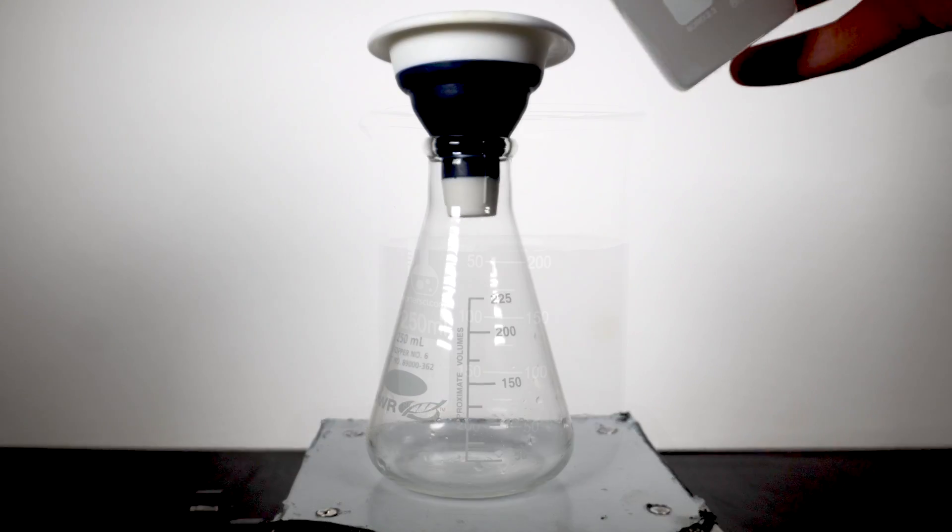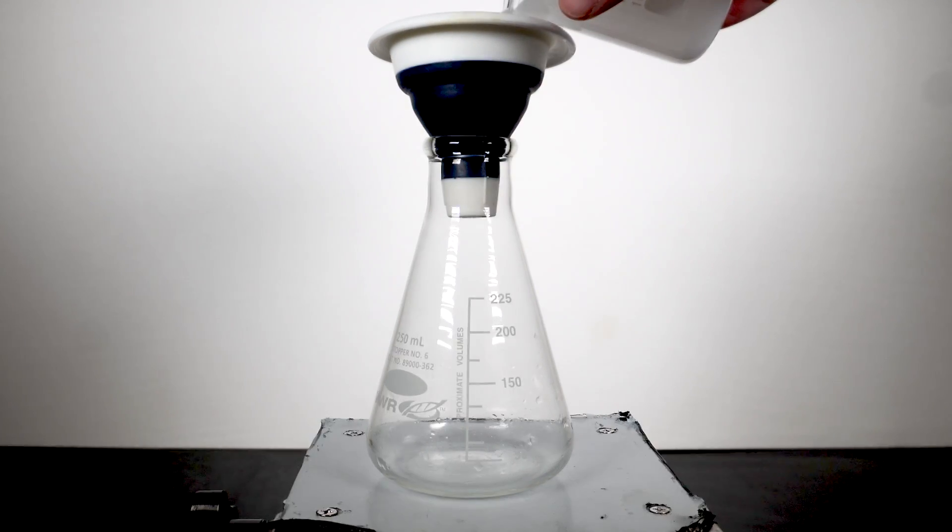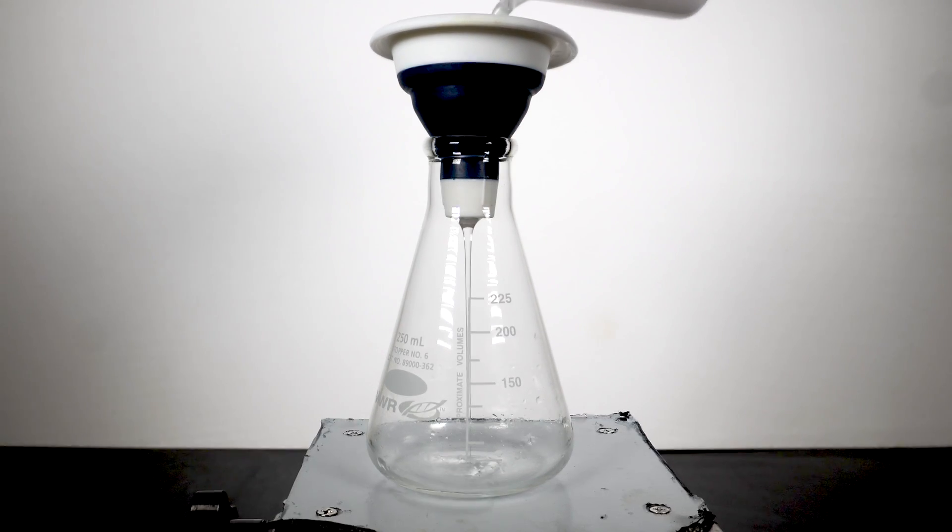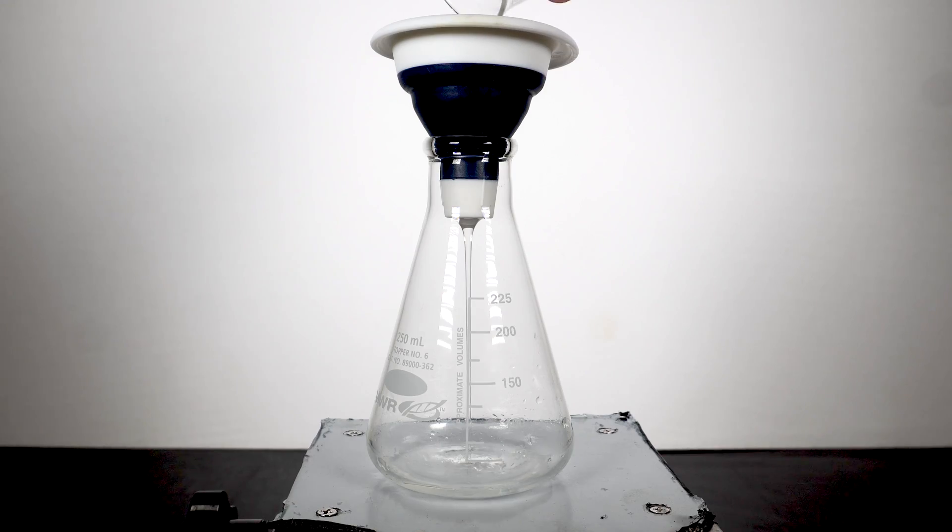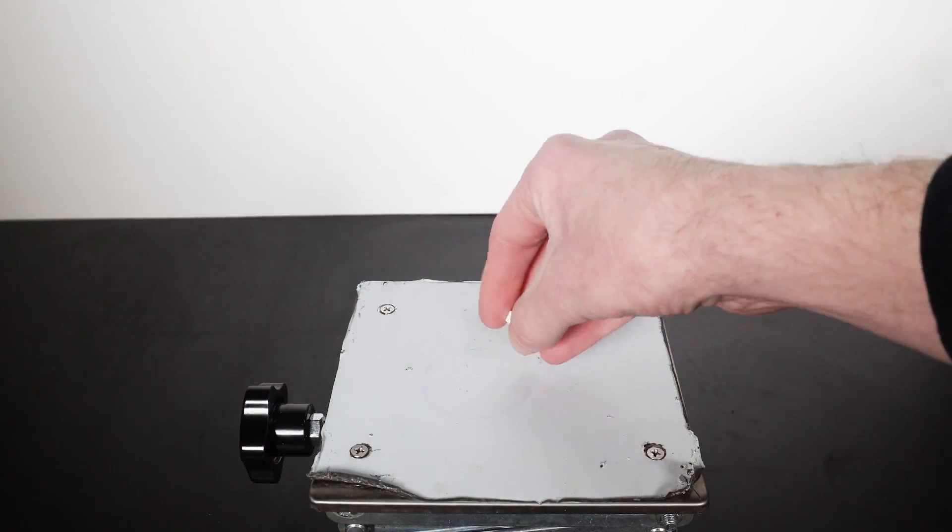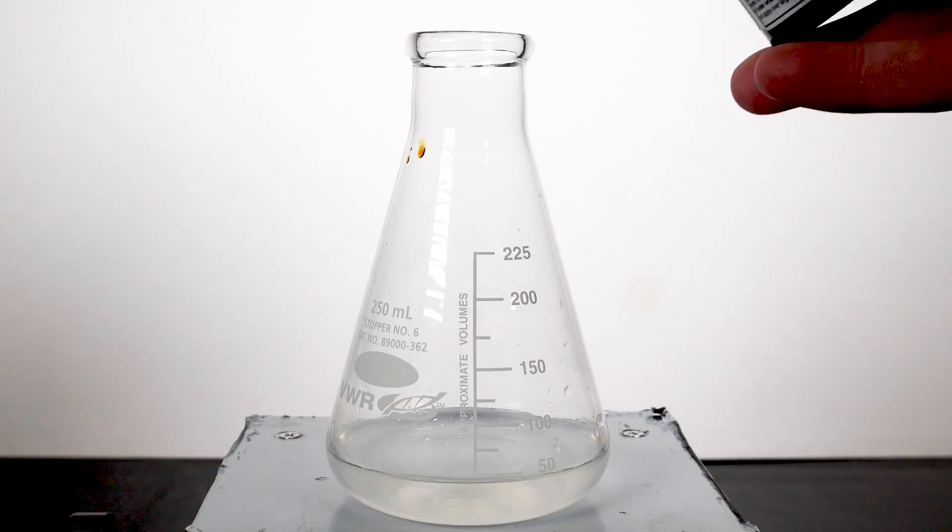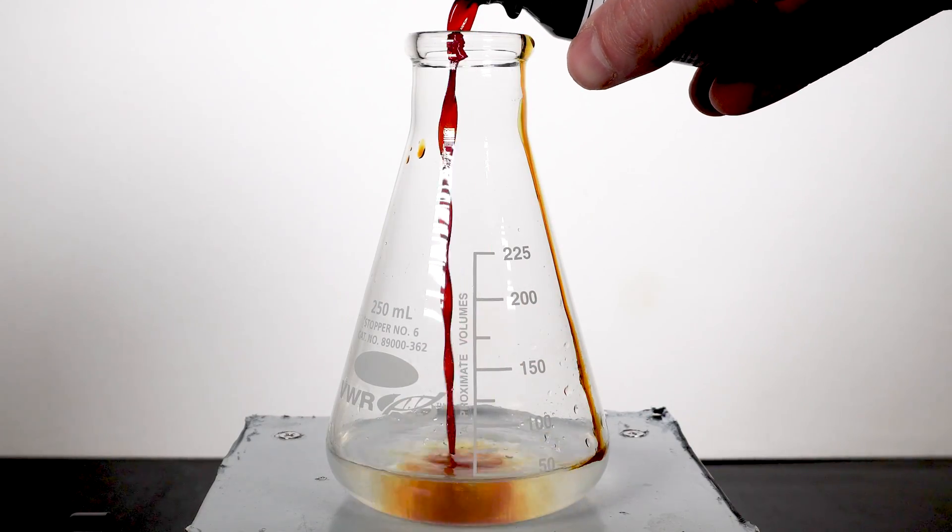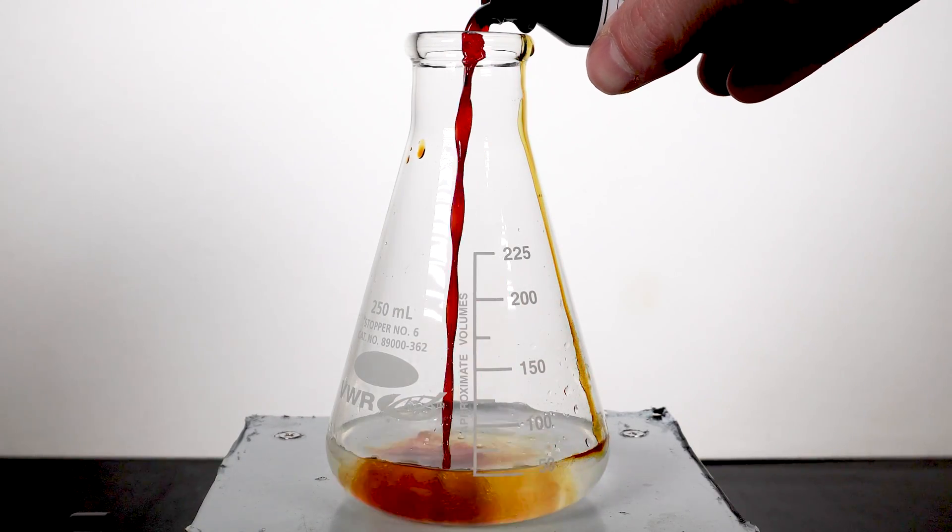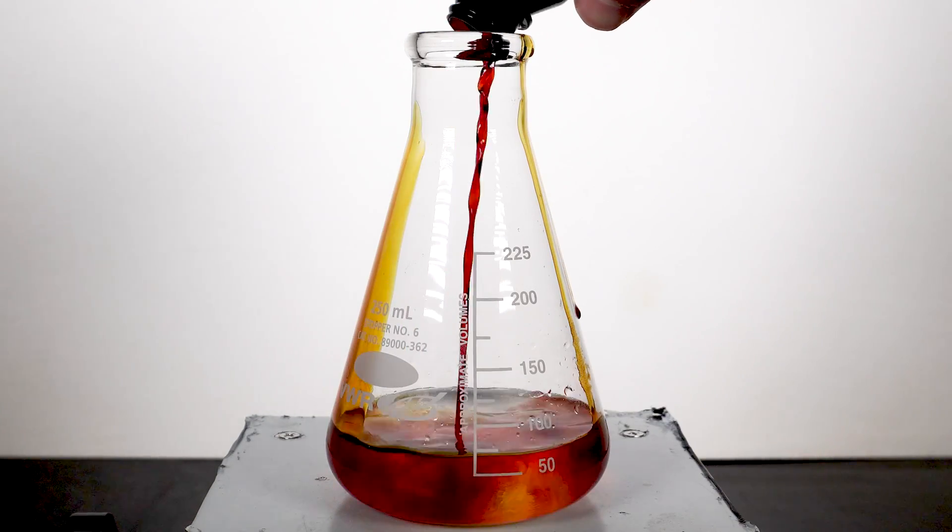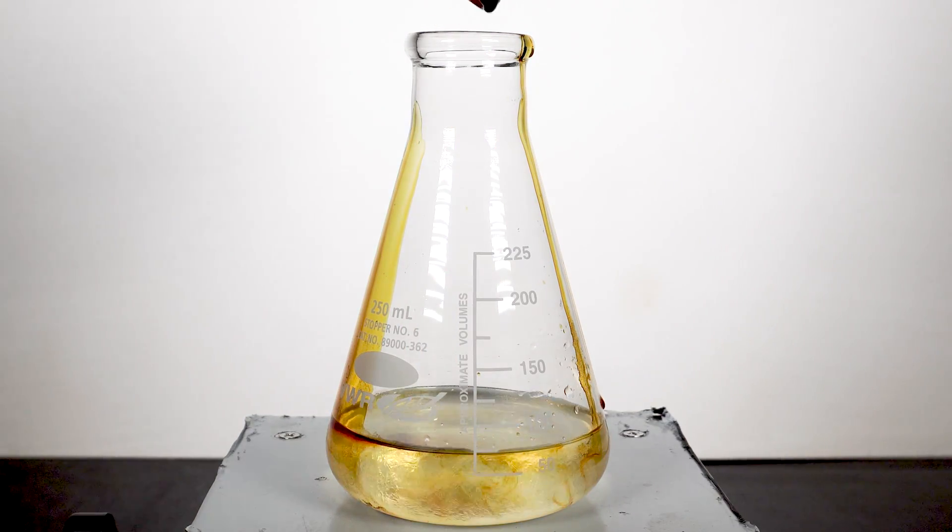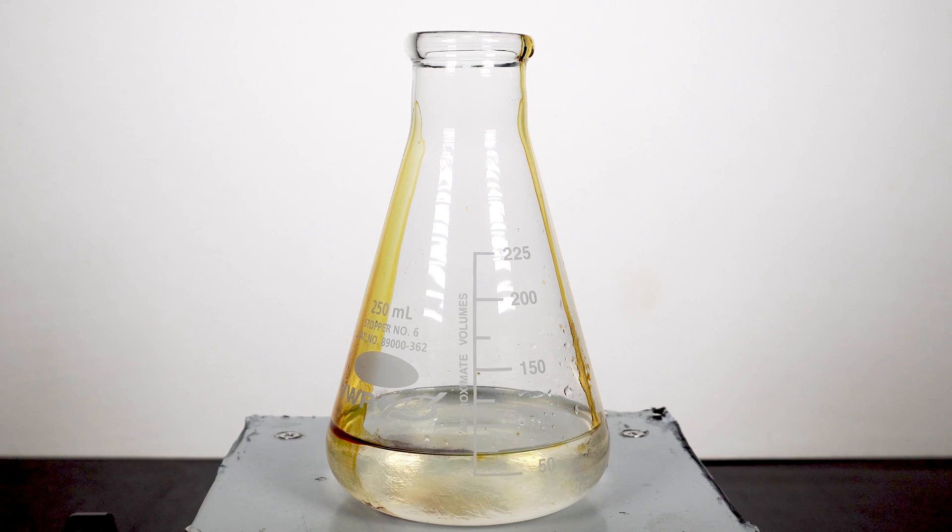The specific clock reaction I am after today is the iodine clock reaction. There are many different variations of this reaction, though most commonly seen is performed with vitamin C, though almost all variations use hydrogen peroxide and starch. Further explanation of how this reaction works will be given later in the video, but first, let's get into making the solutions and perform the clock reaction.